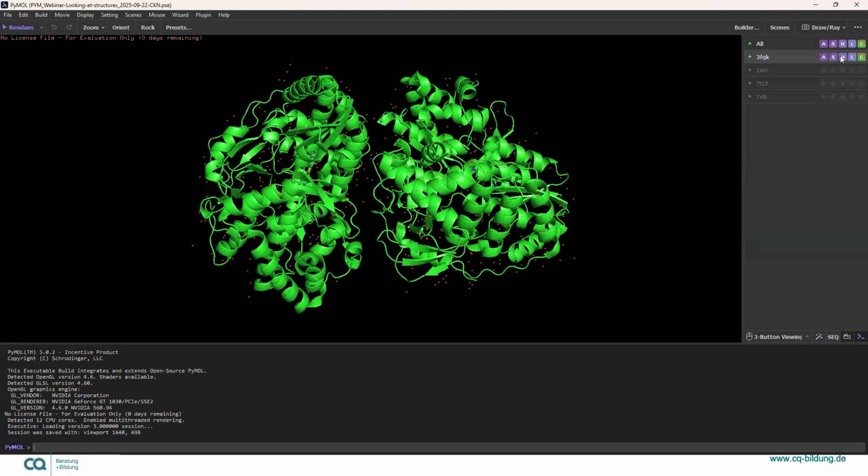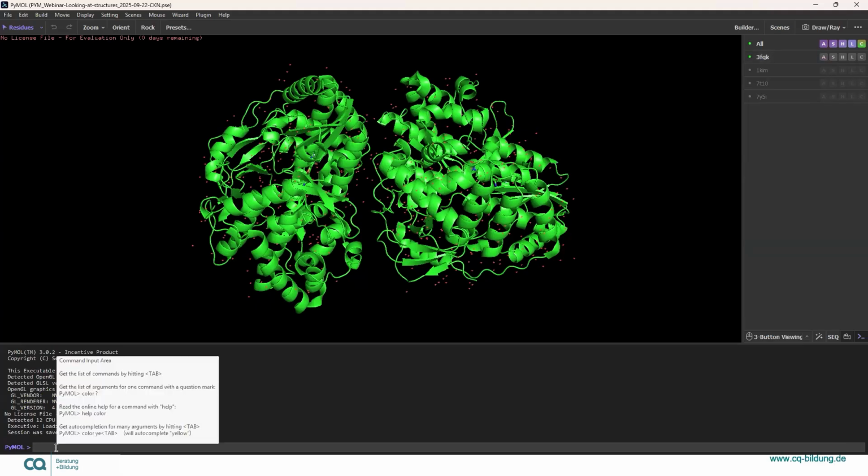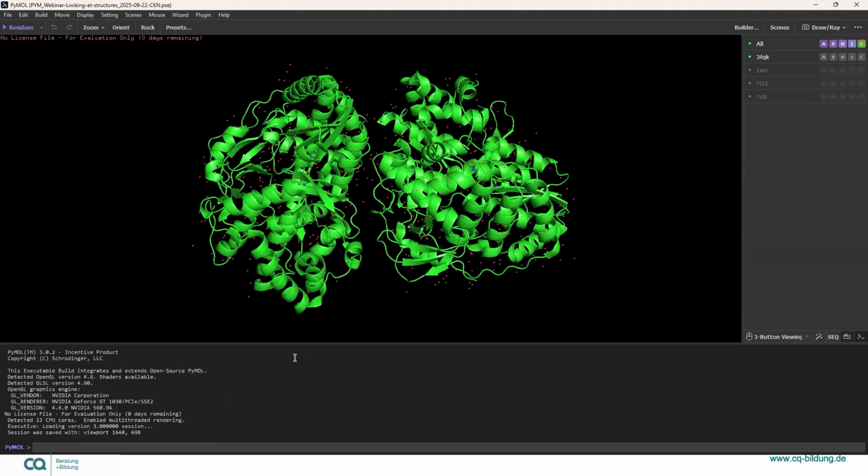their needs. At the bottom of PyMOL, there is the PyMOL command line, which allows users to type in commands which are then executed by PyMOL. For example, when creating selections, this is where the corresponding command needs to be typed in, and then we have the PyMOL output, the PyMOL shell, which will show the corresponding output, the answer of PyMOL to the corresponding command.